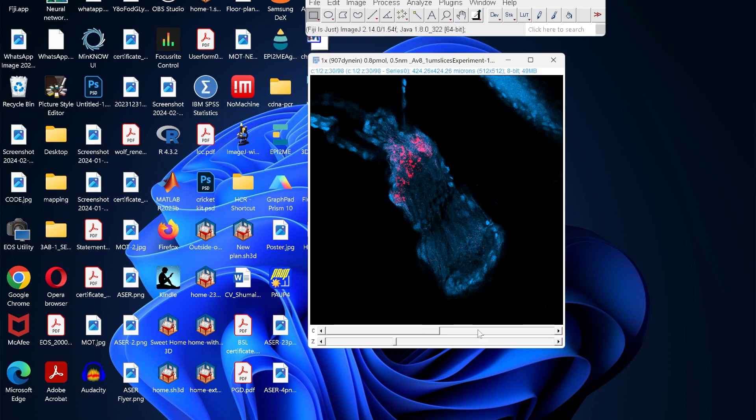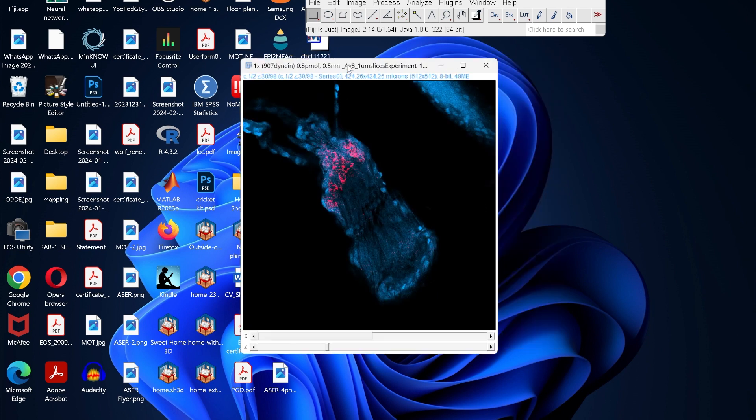For example, this image has two different channels. If you want to split these channels and see the individual channels, we can easily do that.